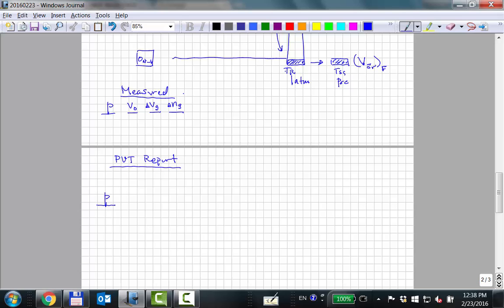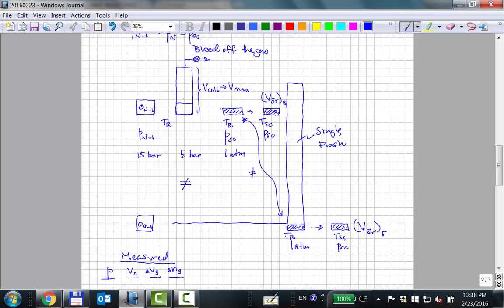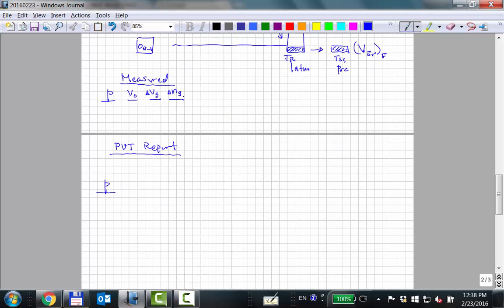What else did we measure? Forget the viscosity, it's a separate experiment. I want to stick to what's actually measured. So we might also measure the mass removed, which would give us molecular weight, and then the composition, with some uncertainty to it. These are the things that are measured.